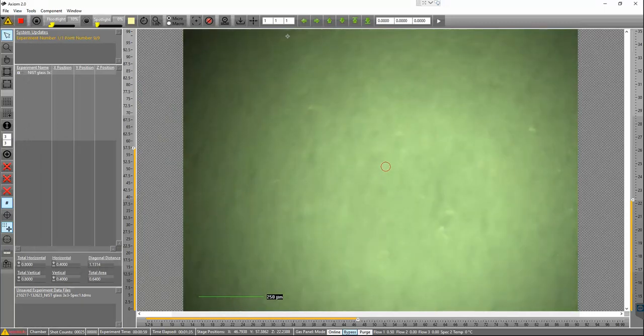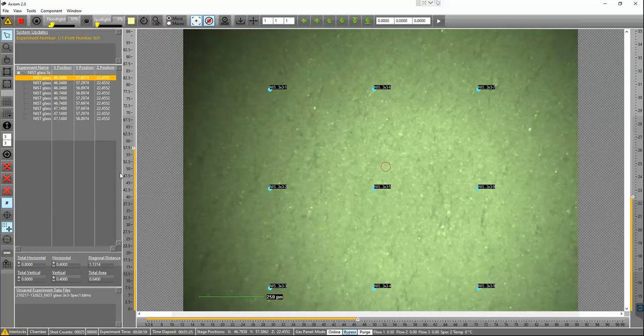Brought it right into focus, and now I'm going to turn the displacement sensor laser off, which I should have done to begin with, but that's okay. So now I'm going to move the pattern over here, so you'll see that now it updates the focus. You'll see the Z position is now the same as the actual stage position. So as I move the pattern, the focus gets updated. And now I'm going to fire this and collect this data too.